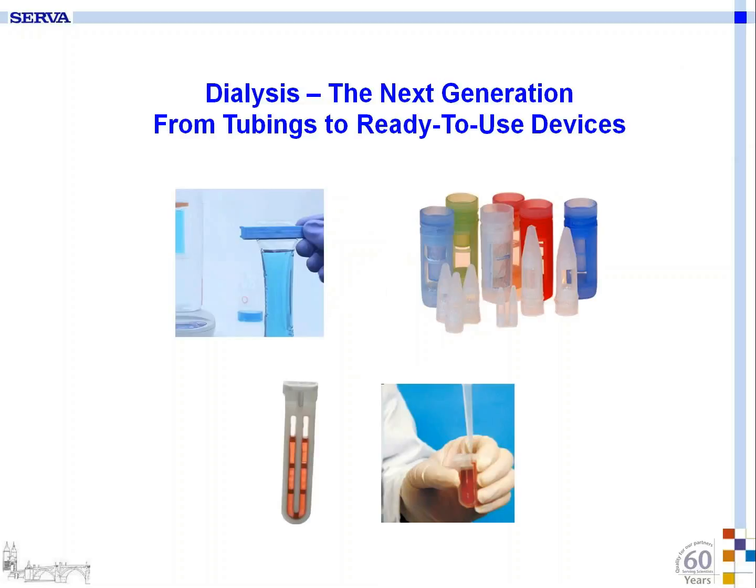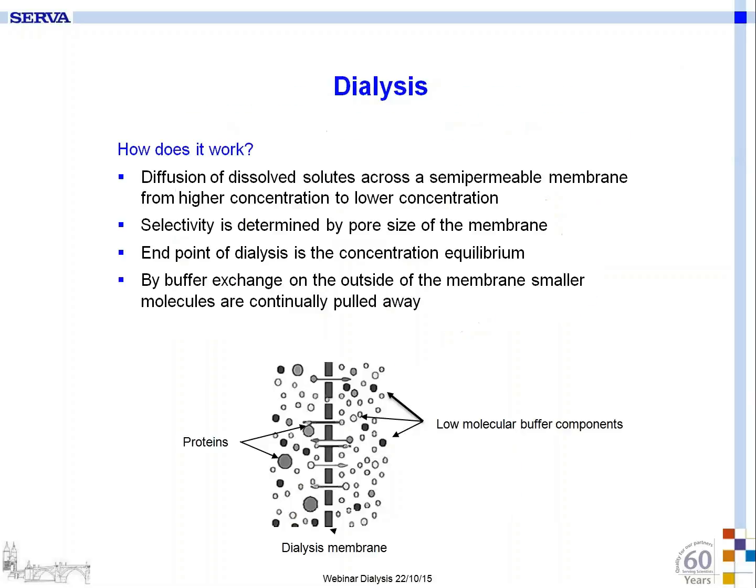I would like to give you first a short overview about how dialysis works before I talk about advantages and disadvantages of standard dialysis tubings and ready-to-use dialysis devices. First of all, how does dialysis work?